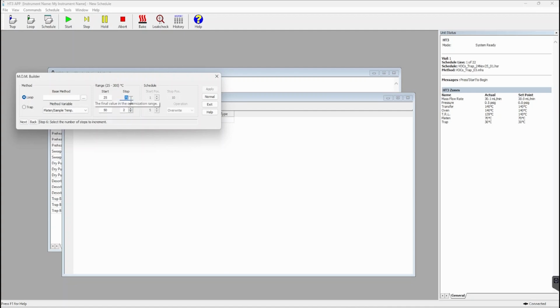degrees and 75 degrees. Now it'll ask where is the starting position, so that'll depend on where the vials are in your carousel. So for example, my vials start in number 4. And then it'll ask you how many vials you're running for each level. So for example, if you're running 2 levels, it'll say you need vials in position 4 to position 7.